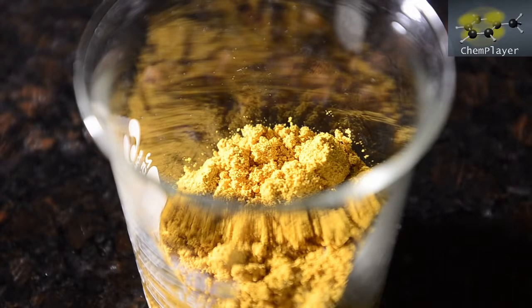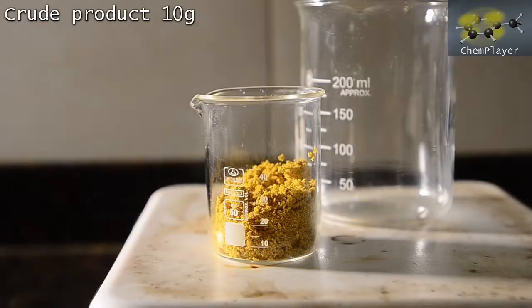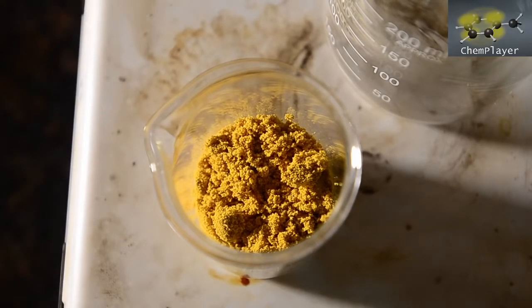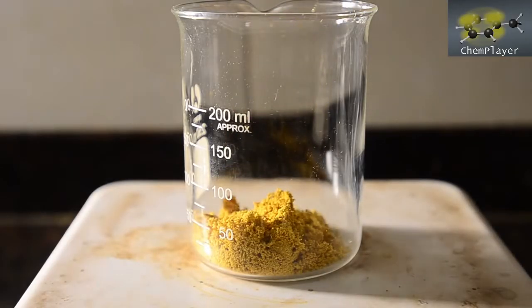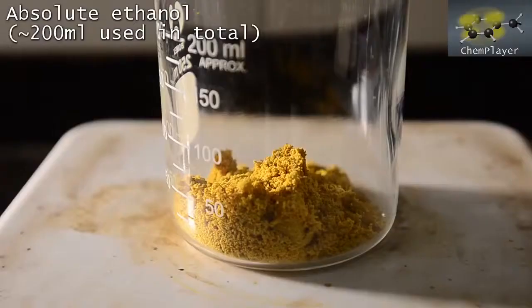We did find a reference to this product being able to be recrystallized from hot ethanol, so we figured we'd give this a go. Here's 10 grams of the yellow crude product. We're going to see if this will dissolve and recrystallize from ethanol. Let's get this into a larger beaker on the hot plate. And now we'll start adding ethanol, washing the weighing beaker first.